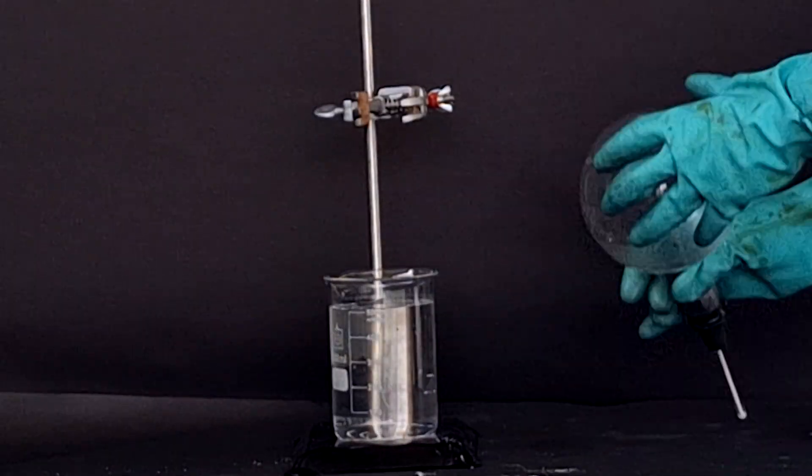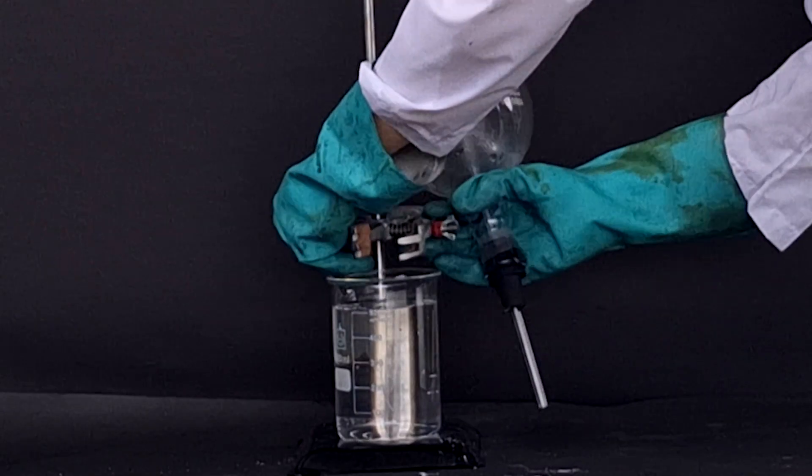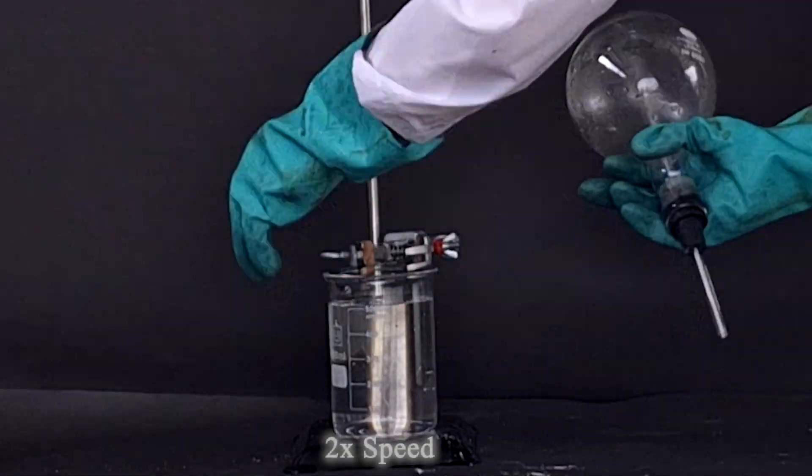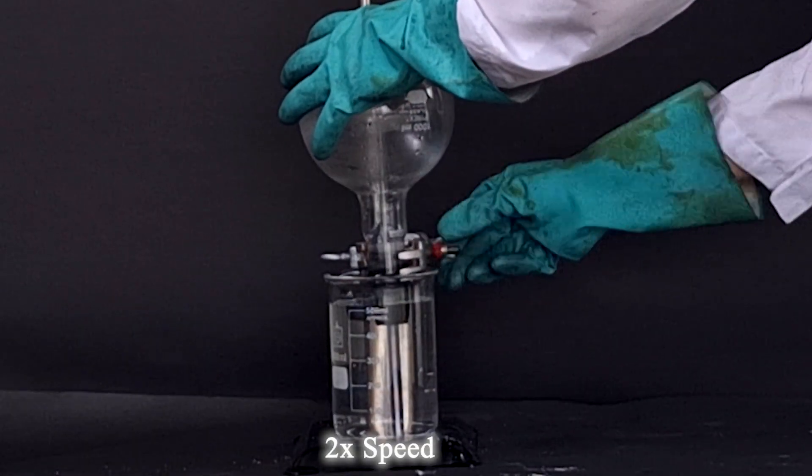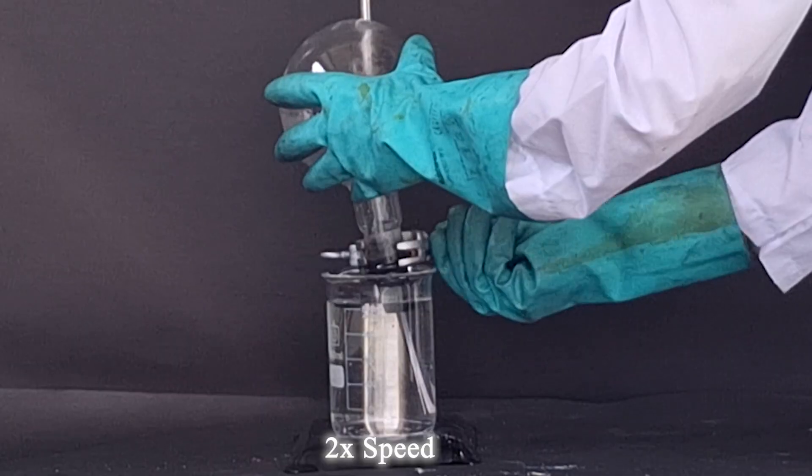After waiting roughly 2 minutes for all the ammonium hydroxide to boil, I separated the boiling flask, now in theory containing ammonia gas, from the preparation chamber.